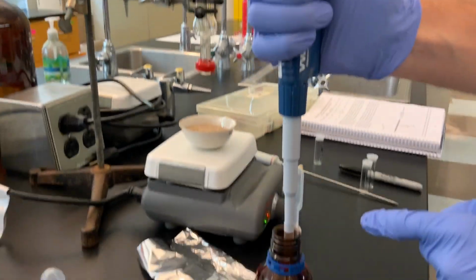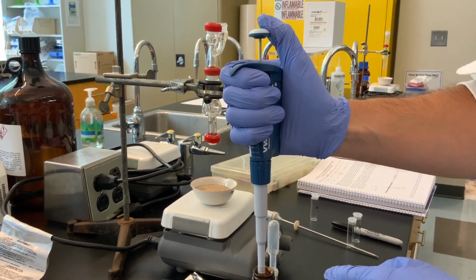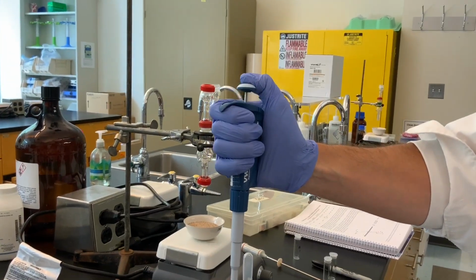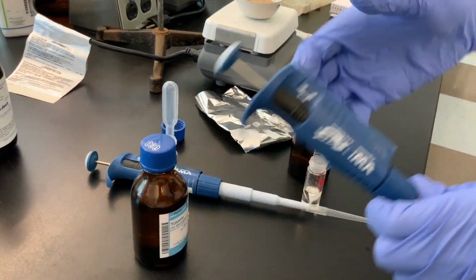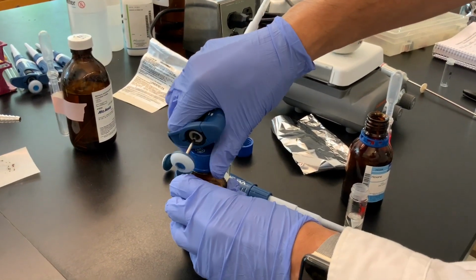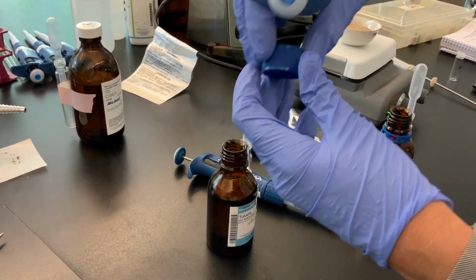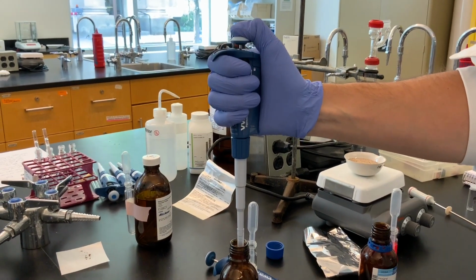So once again, I'm going to very slowly draw up the hexane and now deliver it to my 5 milliliter reaction vial. And then now the second organic solvent, toluene, which is also a water white liquid, which has a distinct odor.